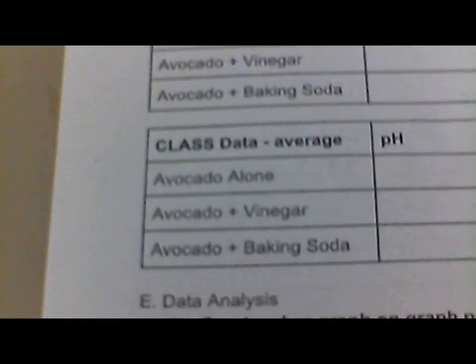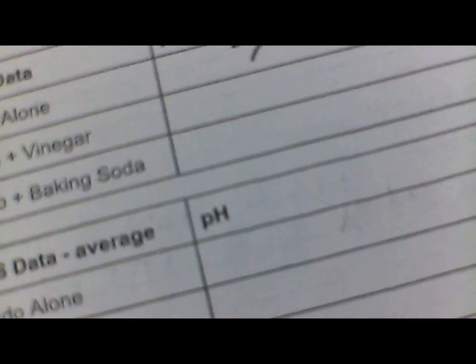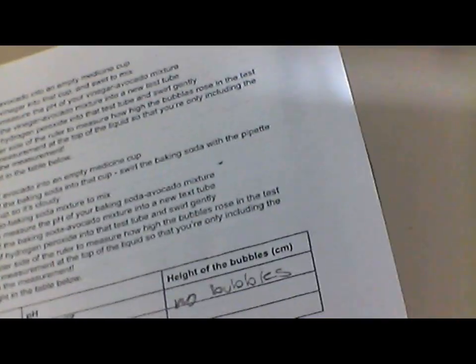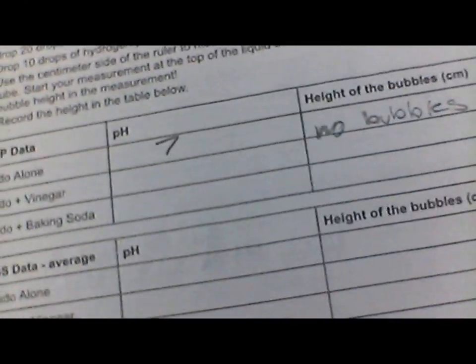It's like 2 centimeters. 2 centimeters? All right. Yeah. 2 centimeters. Okay, this was with avocado alone. Wait a minute, then we got the part where we put the hydrogen peroxide. Is it avocado alone? Avocado and vinegar. Wait, so what's the vinegar?